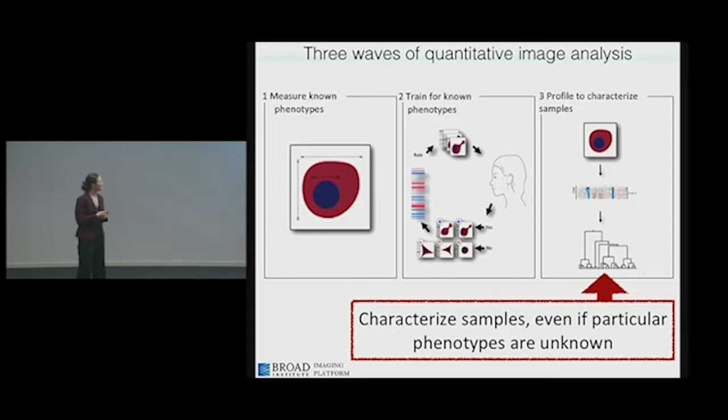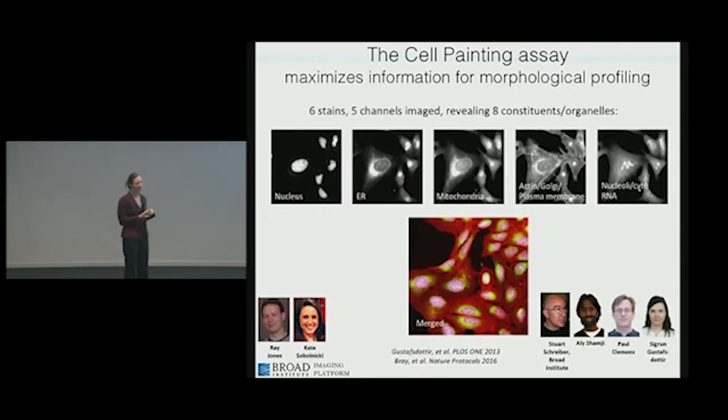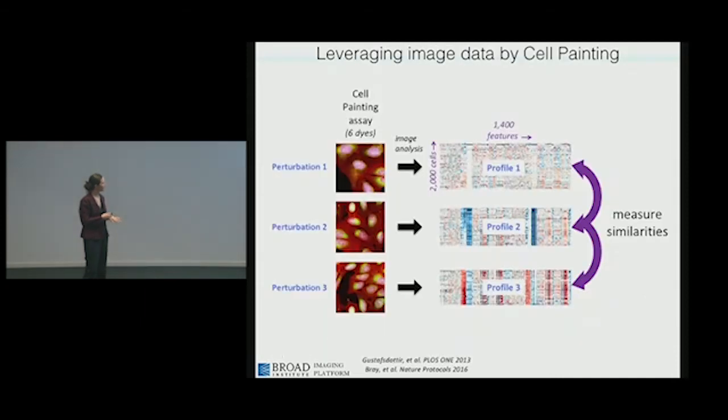So you might ask, well, if we don't know what phenotype we're looking for in a given experiment, what on earth do you stain for? And so it'll become a little clearer over time, but first let me explain an assay that we tend to use. It's called cell painting, and our goal was just to stuff as many stains as possible into a single super cheap assay. So we wanted to run this at scale on hundreds of thousands of samples, so it couldn't involve antibodies or expensive reagents. Nor fancy microscopes either. So we run it on a conventional high throughput microscope, and it stains these different organelles and has been pretty robust and convenient. So that's the cell painting assay we use.